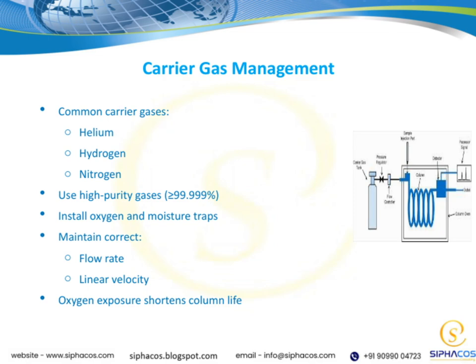And remember, exposure to oxygen can significantly shorten the lifespan of your column, so minimizing oxygen contact is essential for longevity. Overall, careful management of your carrier gases not only improves your data quality, but also extends the life of your equipment, tying back to our overall goal of reliable and cost-effective analysis.